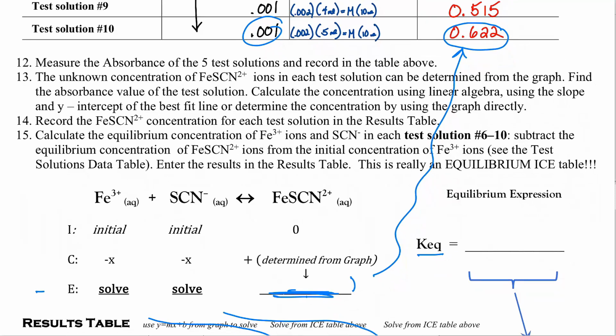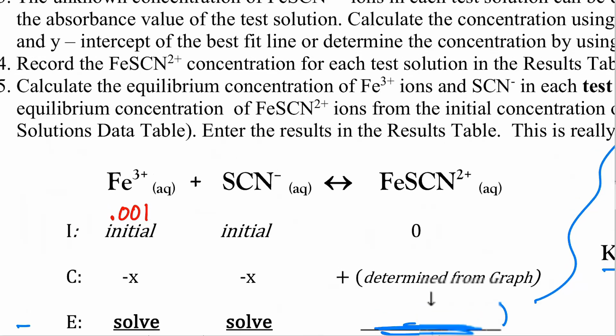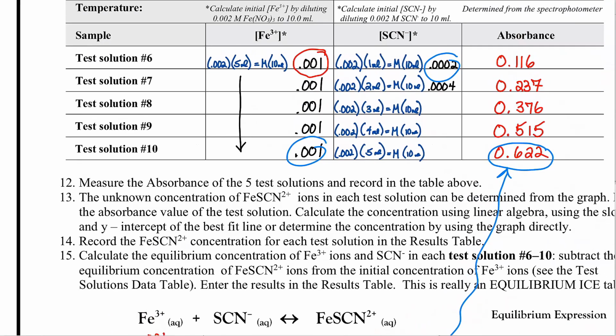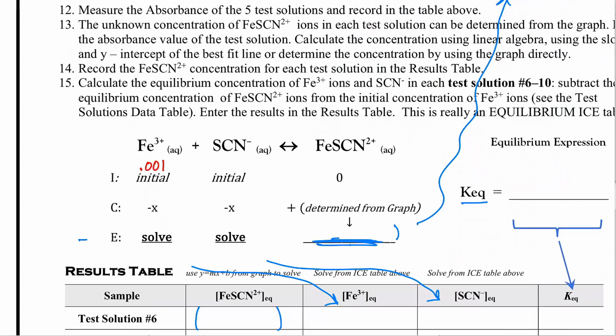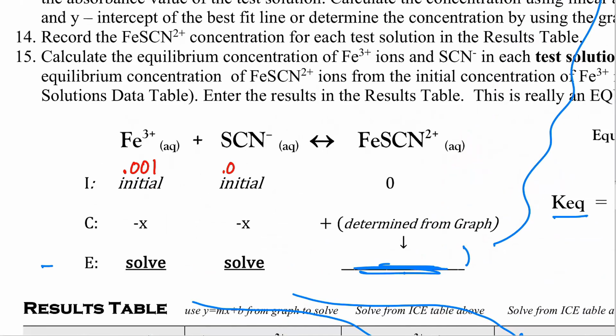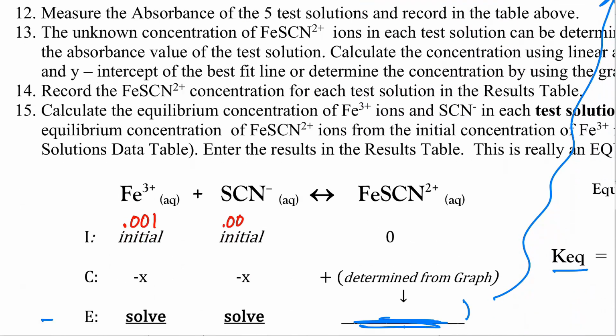So we have initial, we'll make that 0.001. That's the molarity that we just found here for all of the irons. And then we're going to do the first test solution, which is 0.0002. My short-term memory is going at this height. Yeah, 3 zeros. I can do this.